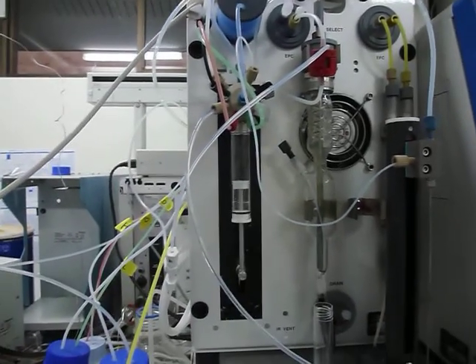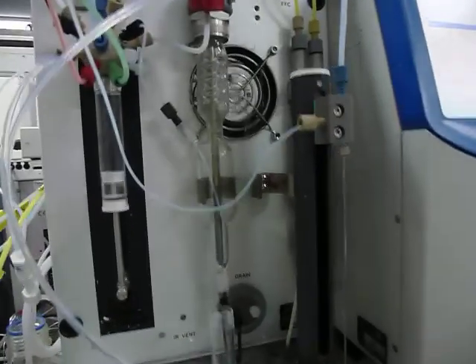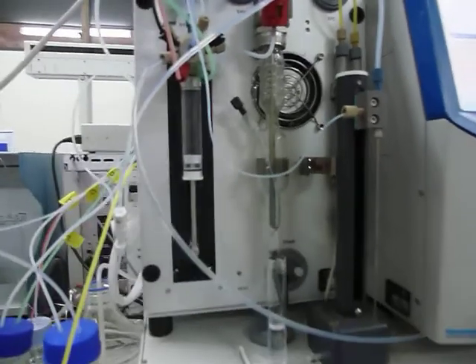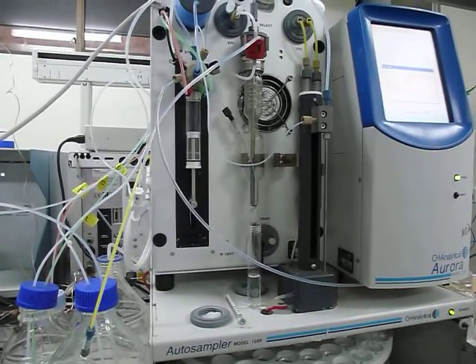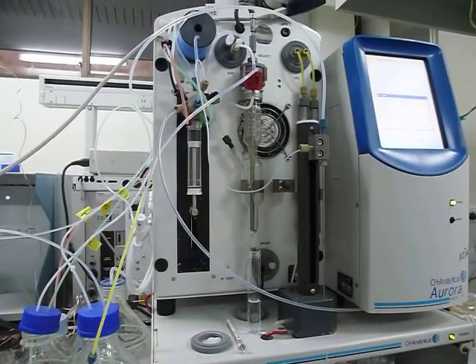It does it to clean the sampling line as well, and also the reactant chamber, that is this glass tube here. Actually, it didn't go there. Surprise.